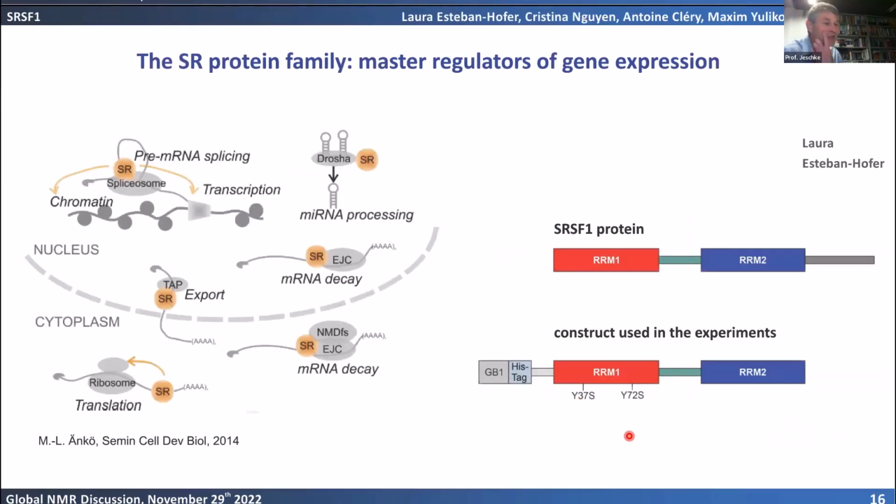systems like that. And the remaining time I will use for an example on the protein that I already showed on the title page, this serine arginine rich protein. And first I want to explain why we looked at this protein. So this protein is involved in several aspects of gene expression. So it binds to the spliceosome.